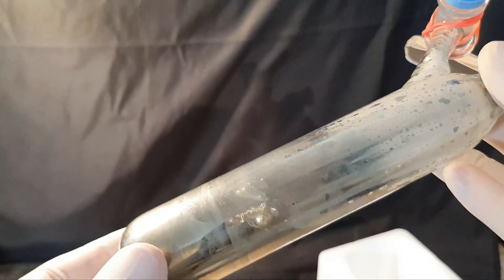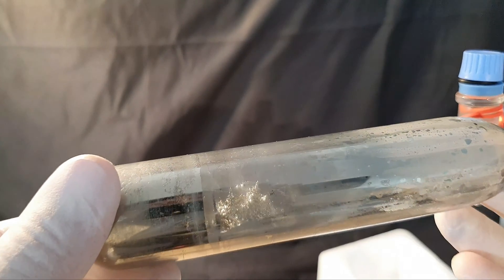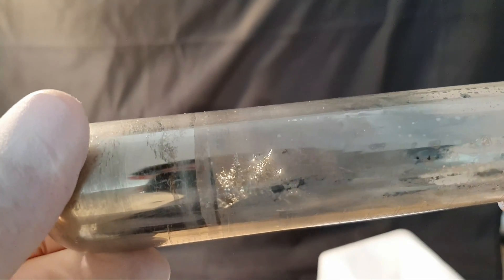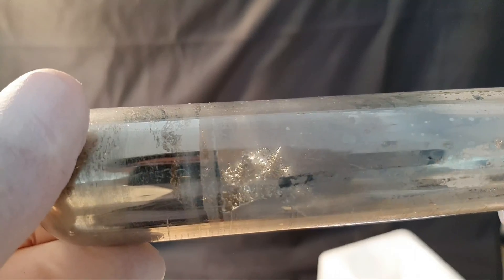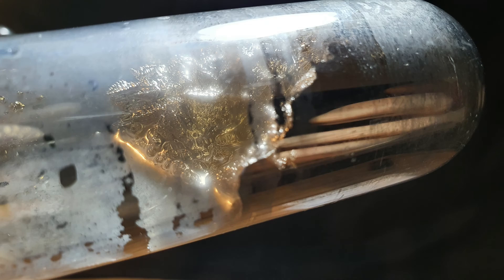After subtracting the weight of the Schlenk flask and glass stopper, I was left with 71.29 grams of cesium, which corresponds to 0.536 moles — giving a yield of around 90%. That is absolutely insane compared to my previous runs. The lithium in this reaction was used in a 1.5 molar excess. The cesium isn't very pure, but it doesn't have to be for what it will be used for. Due to it not being pure, I was surprised to see crystals forming — you can barely see the characteristic dendrites forming, though I wasn't able to capture them well on camera.